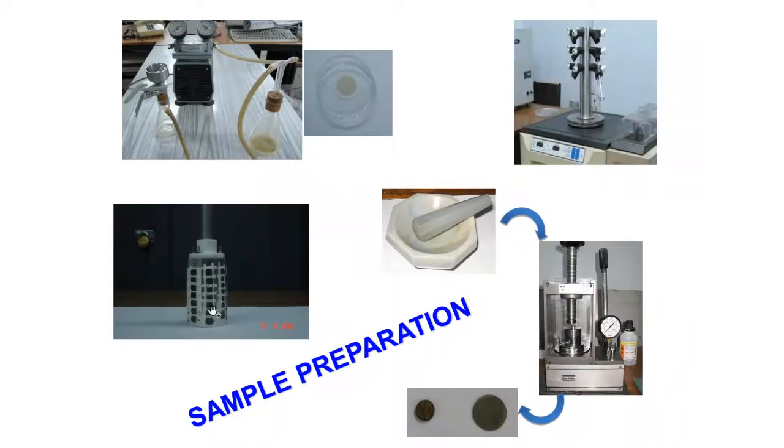And what we have been able to do is an octagonal target ladder when we go for experiments for PIXE. So you see, you can look at the number of samples you can mount. Because of this, we have really reduced the preparatory time, because whenever you do an experiment, there is a lot of preparatory time. We have substantially cut down that time because of this.